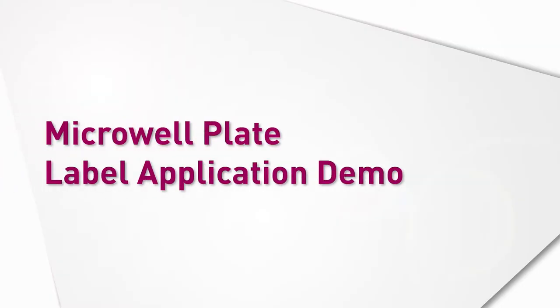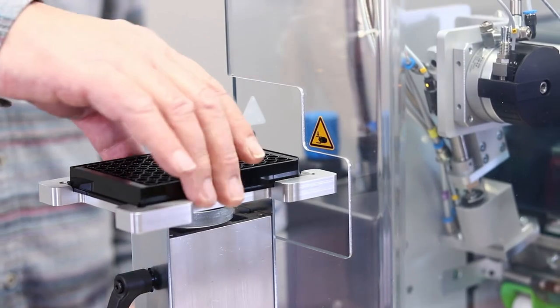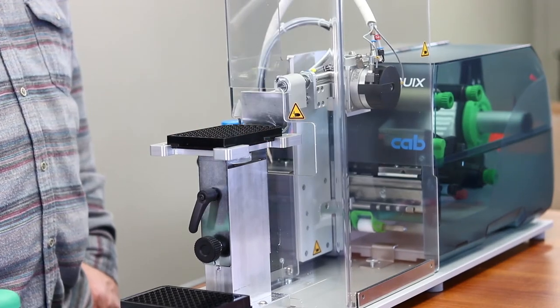For this demonstration I installed the optional hand switch. You can also order a foot switch or you can use the digital I/O to install your own product sensor.